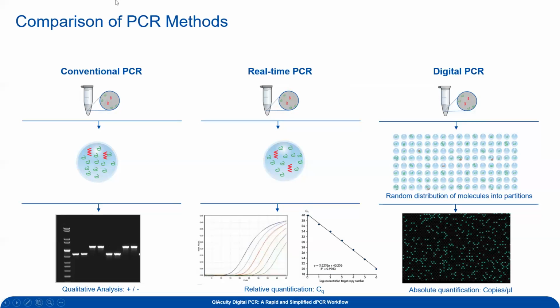Yes, so we don't use emulsions or droplets. What we use is the plates are actually manufactured to have all these partitions in the well. So they're essentially stamped into the plate at the manufacturing facility.